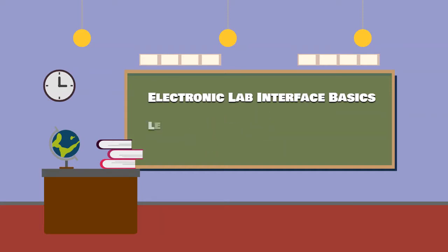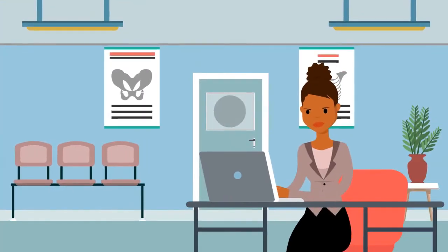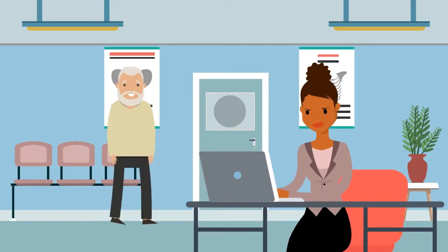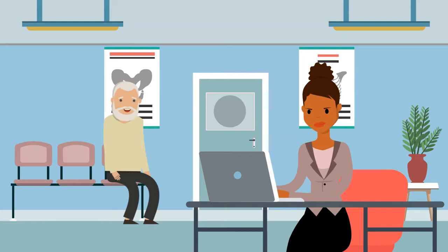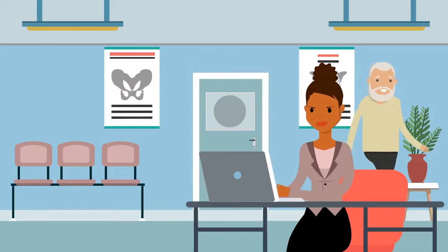Interfaces come in many different shapes and sizes, but today we'll focus on a generic bidirectional laboratory interface. A provider's workflow without an electronic interface looks something like this. First, the provider places a lab order in the electronic medical record system.